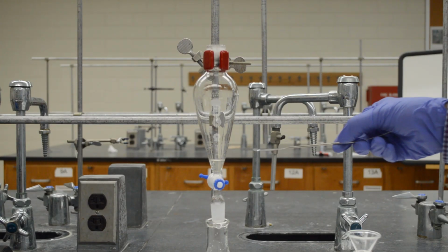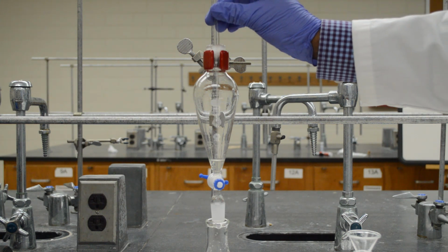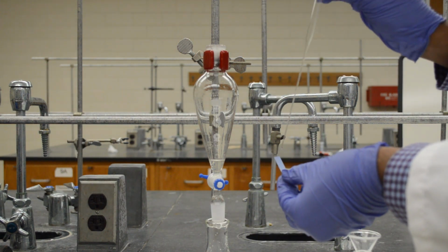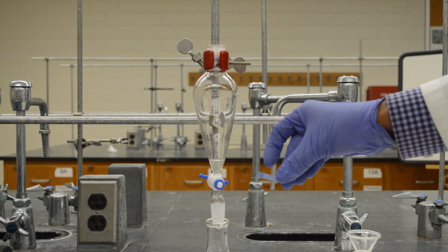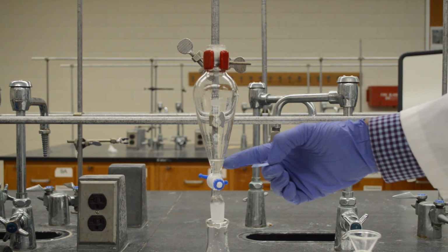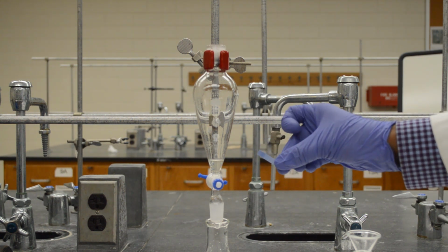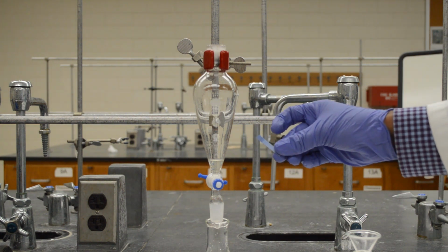Now I'm going to test the pH of this organic layer to see if I need more base. Take a pipette, take a drop of organic and put it on a blue litmus paper. Okay, it didn't turn red, which means the protons are gone. The organic layer is no longer acidic. That's what we want. We had enough base to remove the protons from the oxygen.